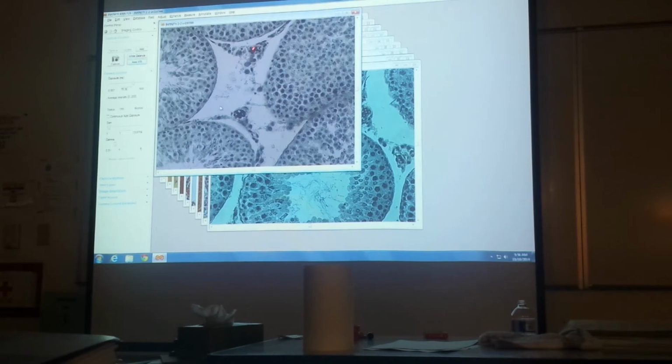That right there and that right there are capillaries. It might be hard to see in the back. Those are red blood cells in there. All these are interstitial cells. And we're concerned with the blood vessels now. Right there and there. It's a little better here. It might look better on your computer screen at home. Take a picture of that.